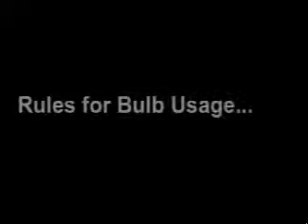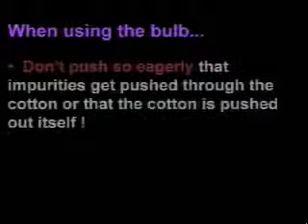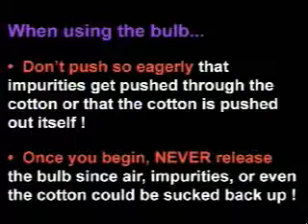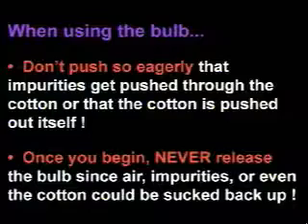But what's that I hear? You're a bulb fiend? Or what's worse, you just have no patience? If you insist on using the bulb to expedite your filtration, then there are some rules for its usage. When using the bulb, don't push so eagerly that impurities get pushed through the cotton or that the cotton is pushed out itself. And once you begin, never release the bulb, since air, impurities, or even the cotton could be sucked back up.